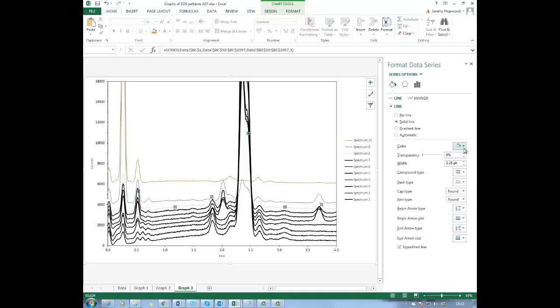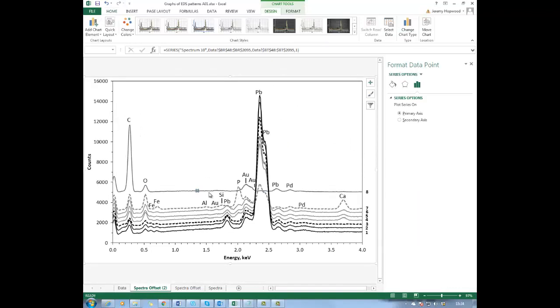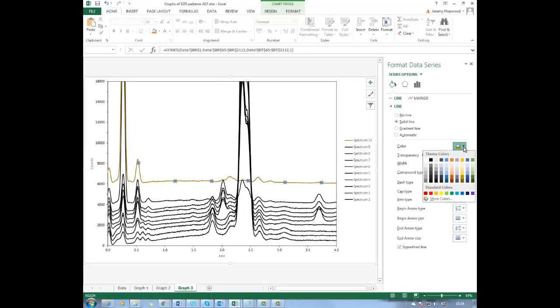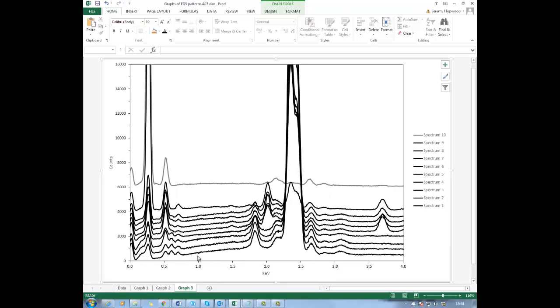That should be black. That one black. And I know that the last one was kind of a grey colour. I'm not sure which grey. Okay, we'll try and find it. Still 2.25, but let's make it grey. Alright, so we're nearly there. Yes, we're going to alter these shades a bit later on.